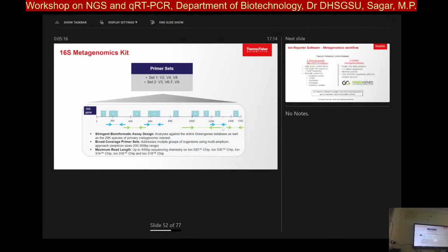So the first part that we are talking about is 16S metagenomics. Metagenomics is more about the 16S gene. It is widespread and it has certain variable regions. You're studying the variable regions in such a way that is more specific to each species. Okay? So Lactobacillus would have its own variabilities in these ways. Target that and use that to know how much microbial content your sample has.